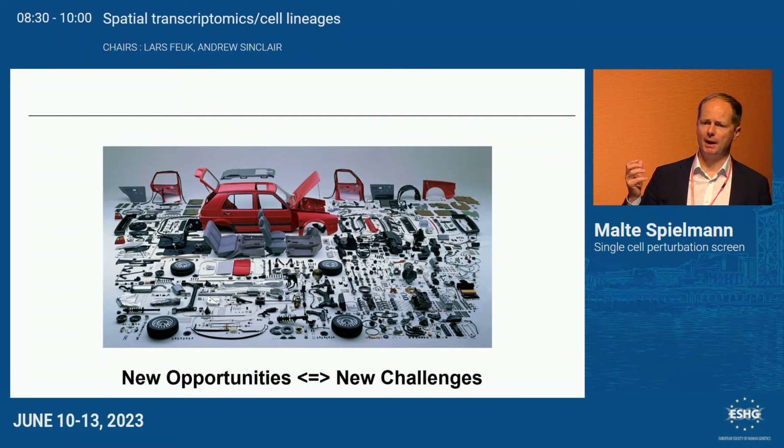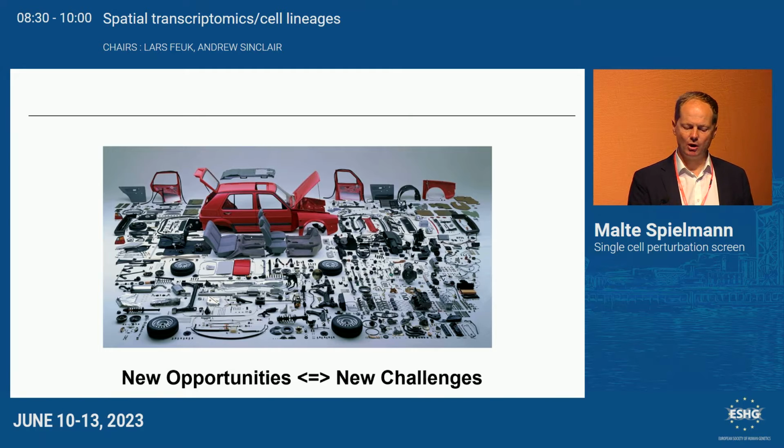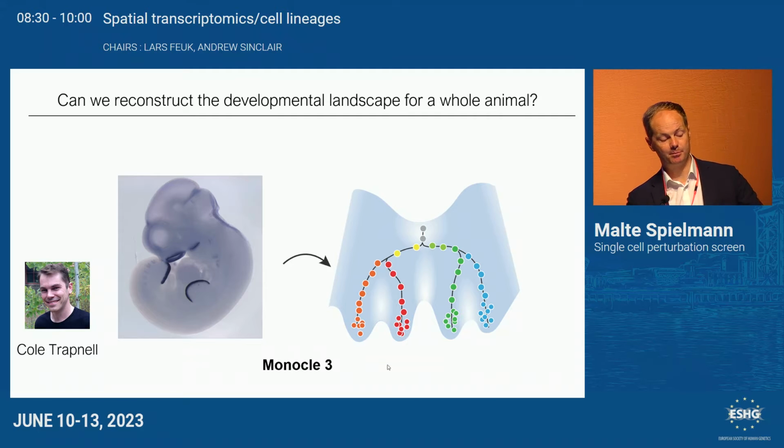And for this, we need bioinformatics, and I cannot emphasize this enough. We all know that large data sets need great computational scientists, and we at the time paired up with a guy called Cole Trapnell, a single-cell bioinformatician, and he has an algorithm, or we developed it, where we can now follow cells through developmental time. And the idea is you have a cell, and at some stage it will make a decision to become that cell type, or in this case, go into disease or stay healthy. And wouldn't that be awesome if you could do that on your single-cell data set?